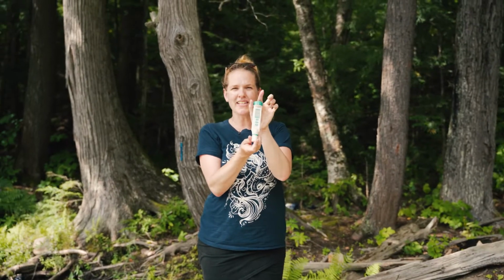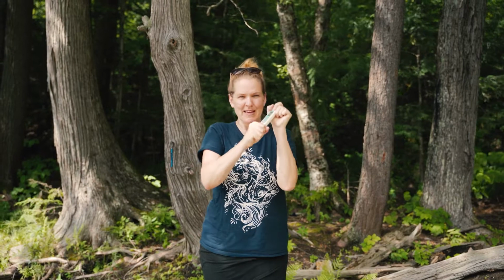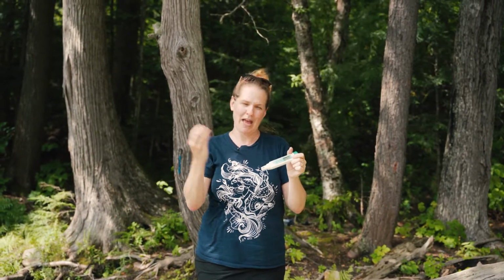Next, we're going to get our conductivity meter out. And this is going to measure conductivity and water temperature. They need to be measured together because they have a relationship. Some of the meters you have to pull the cap off. In some of our newer models, there's no cap.